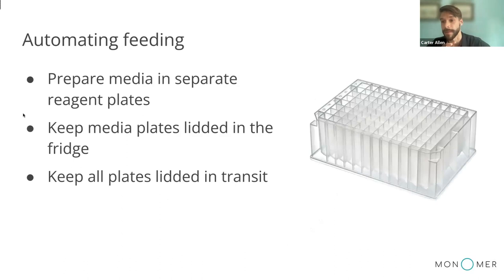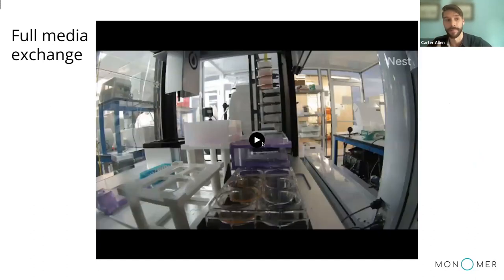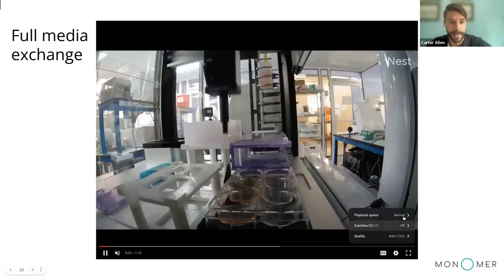Some quirks of automating feeding, and suggestions that we have that might be different from manual cell culture, is that we suggest preparing media in separate reagent plates that are 96 well format. This decreases the likelihood of contamination, and you don't have to waste a bunch of tips. If you're trying to feed multiple wells inside of a plate, you can remove media and exchange with the same tip that you aspirate media with. So you can see that here.